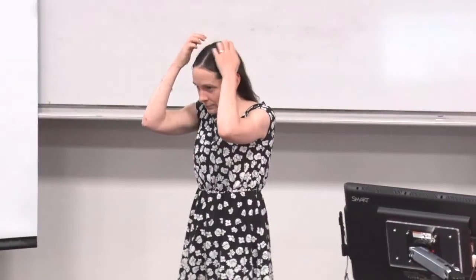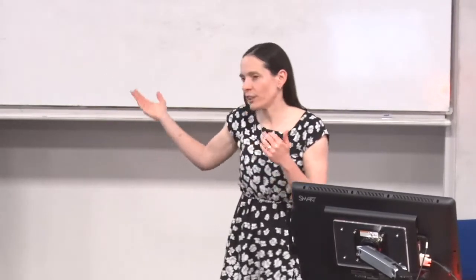You actually stole my question, so I was going to start with that, but just to follow up, clearly electrification is the future, so can you stick a potentiostat in at any point to look at how atoms change in real time? So we have done experiments without liquid, looking at applying a bias potential and causing intercalation, for example. It's work in progress, yes, to make it happen with liquids. It's more challenging, but it's absolutely possible, even with water for the start. That'd be brilliant.